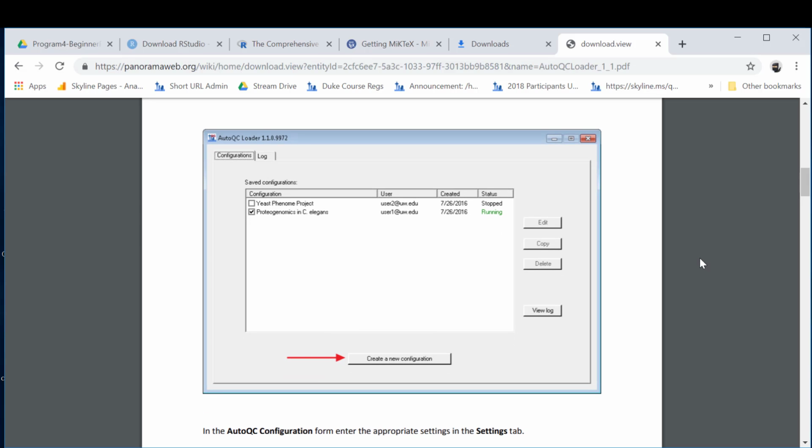So when I open up AutoQC Loader on my instrument computer, we have a whole bunch of user profiles, because the way we have set it up in Mike MacCoss's lab is each user on each instrument has their own personal file organization, not like standards.